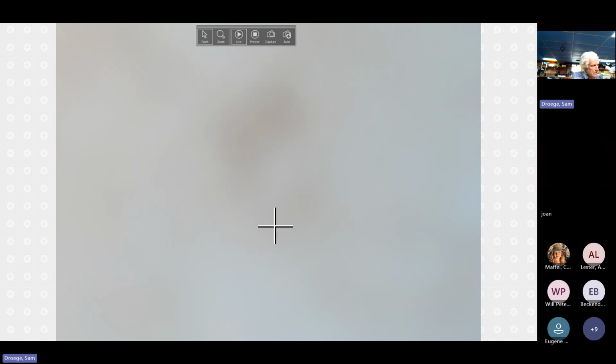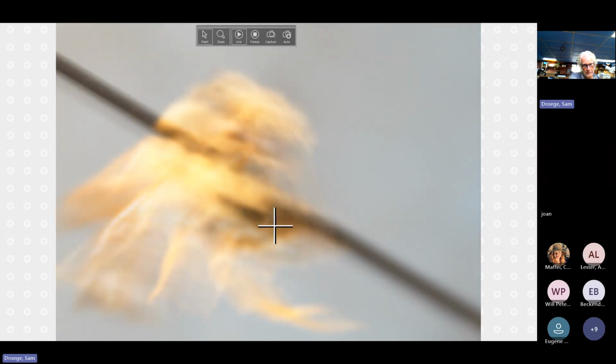And I'm trying to get a good specimen here of a male. But in Hippodes, you get an orangish coloration in here, and this shows it pretty well in the tarsal segments, particularly the basotarsus.